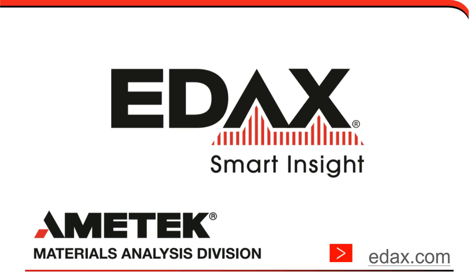Let's see, yes, is CompoMaps available with the EDAX TEAM software? Great question. CompoMaps is a function that EDAX has had for a really long time. It's been in our Genesis software, it's been in our TEAM software, and we've really revamped and revised it for our Apex software, and we've put it front and center with our Apex software because of the great value.